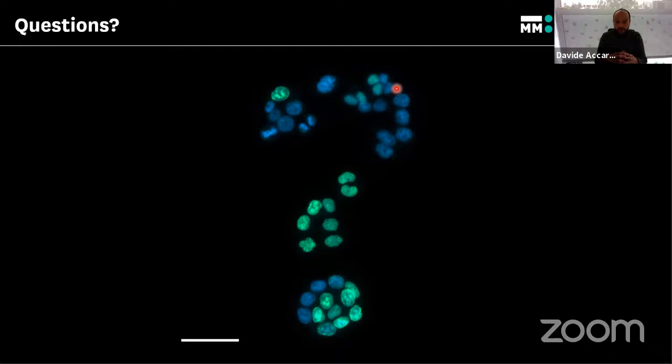If you need to image a very large area very quickly, then you necessarily need to renounce some of the resolution. Although nowadays there are systems equipped with scientific CMOS cameras that provide bigger chips with better resolution.